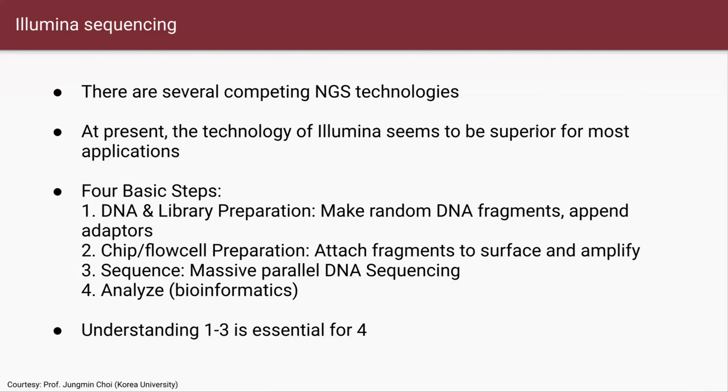Okay, so for Illumina sequencing, there are many different competing NGS technologies, but at this stage, around 2024, Illumina is the best technology in terms of the price, in terms of the throughput, in terms of the usability, in terms of the coverage. So people use Illumina the most.